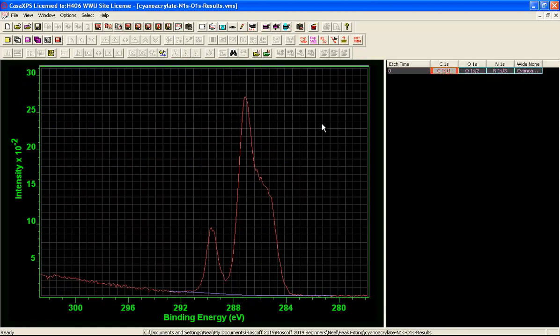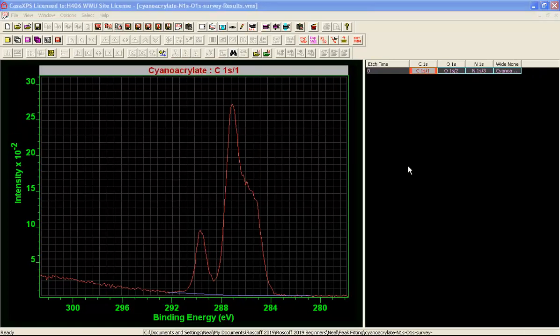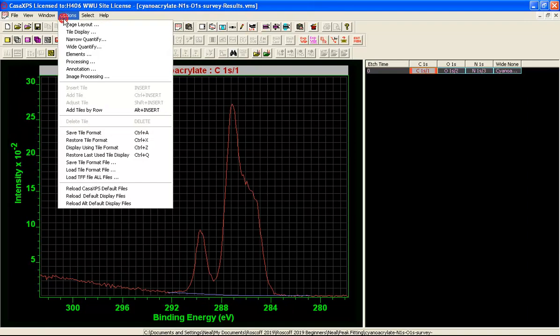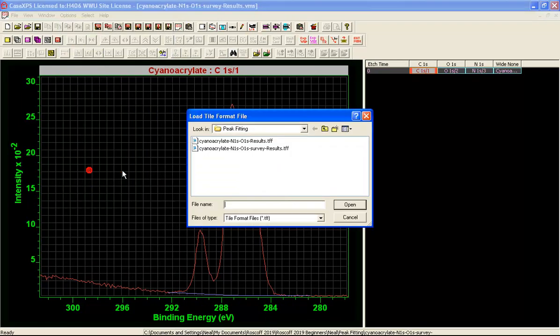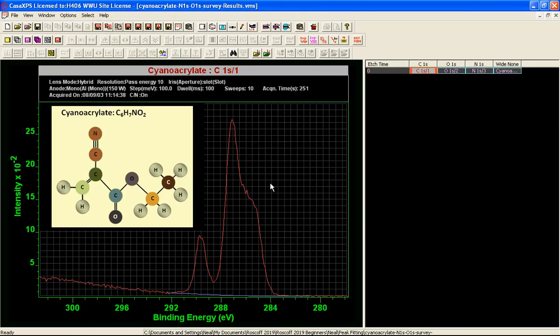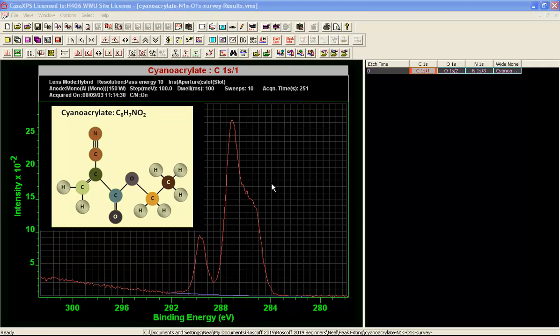So when we construct a peak model for these data it would involve more than six component peaks. So we will now gather the information that we know about this sample in order to construct a peak model for this carbon 1S envelope. So we know that the relationship between the oxygen, nitrogen and carbon suggests that we have close to six but a little bit more than six carbon atoms corresponding to these oxygen and nitrogen.